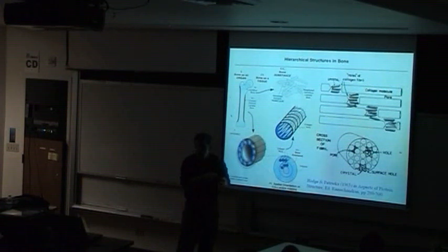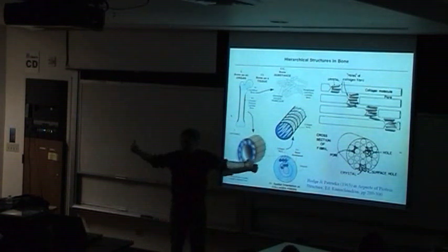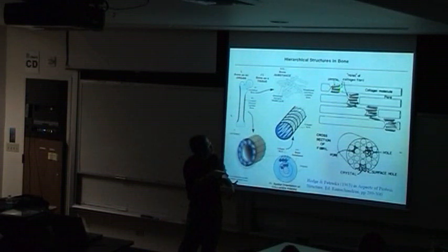About 300 nanometers in length. And these are not continuous; you actually have some holes. So between these is a hole, and this distance from here to here is, based on the model, 67 nanometers.